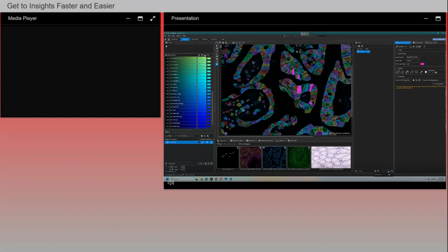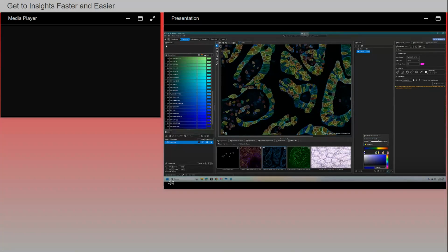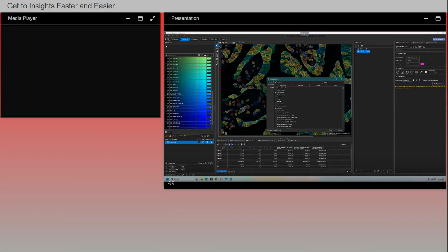And that's a transparency option, and you can also color based on measurement. So in this case, you can color by measurement using area, for example, circularity, and you have many different measurements you can add. So when you go to the spreadsheet, you can have a list of different measurements. Based on morphology, intensity, position, and count, we have a very long list of measurements you could apply. Color by different measurements. You can have fun.